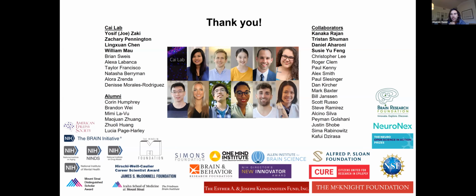Cool. There's another question, which I think has come up a few times in the chat: once you dial in parameters, do you need to figure out the parameters on a per recording session basis, or can you dial them in across all recordings from the same animal, or, within a whole experiment, figure out parameters that could be applied across all animals in that experiment?